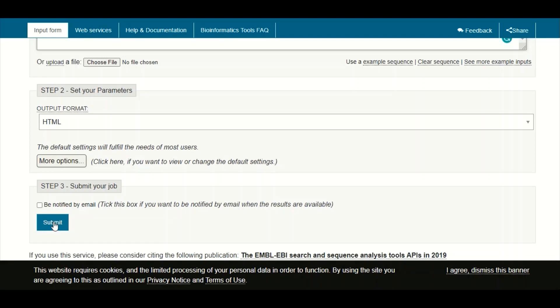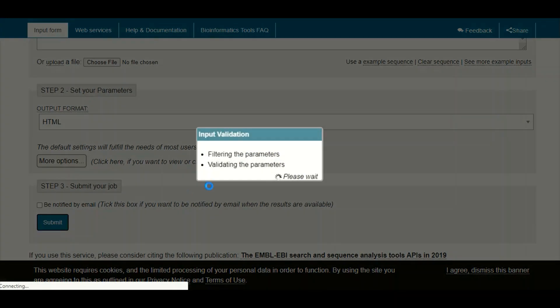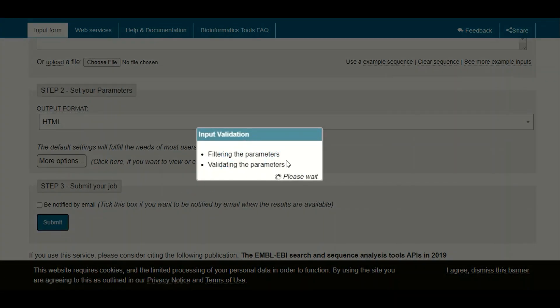We recommend not changing the default values, otherwise it may be difficult to have a proper interpretation of your multiple sequence alignment as a beginner. Click on the submit button, and after a few moments your job will be done.